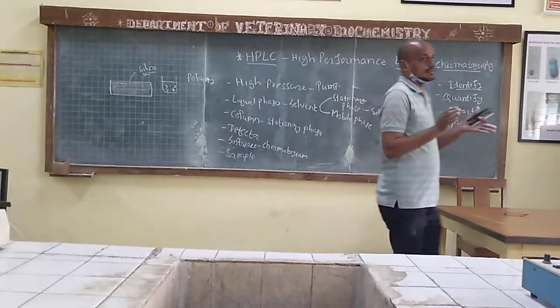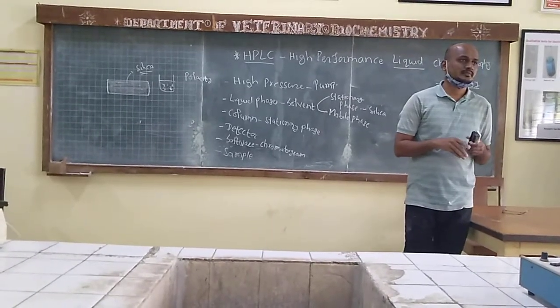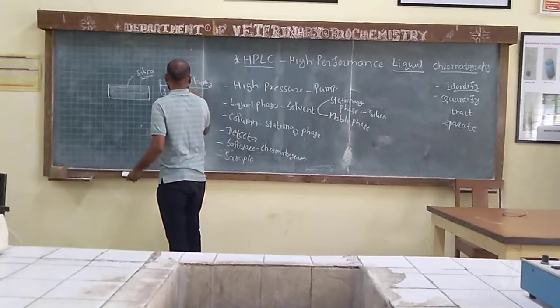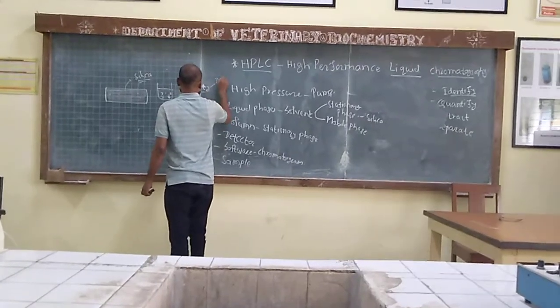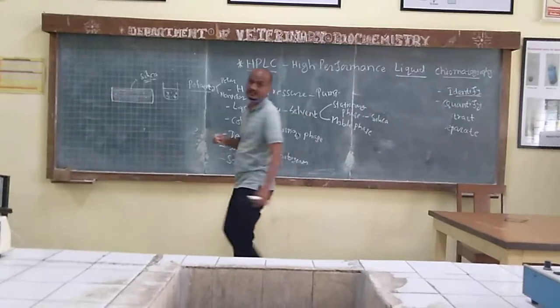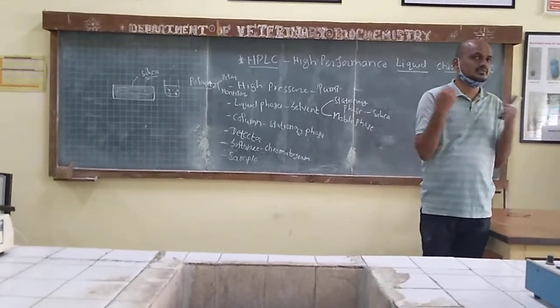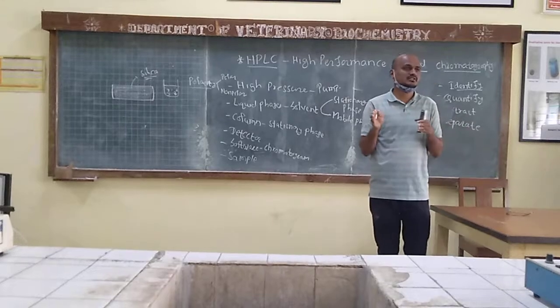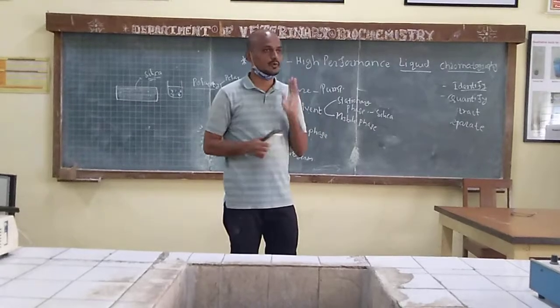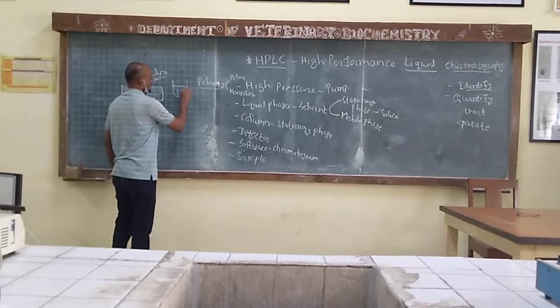So for example, there is a first year student and an MS student. They are getting attached to the silica, and those which are non-polar will separate. Polarity, polar and non-polar. For first year students and last year students, there are knowledge differences. Master students know some more things. Based on that, you are applying some criteria, right? So polarity is one criteria of a molecule.